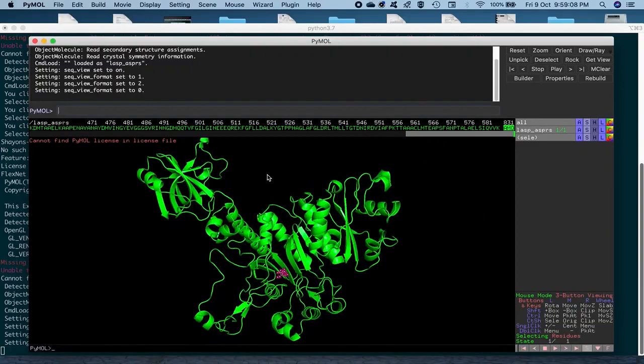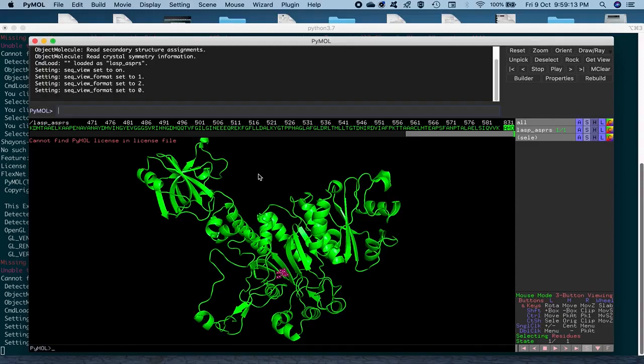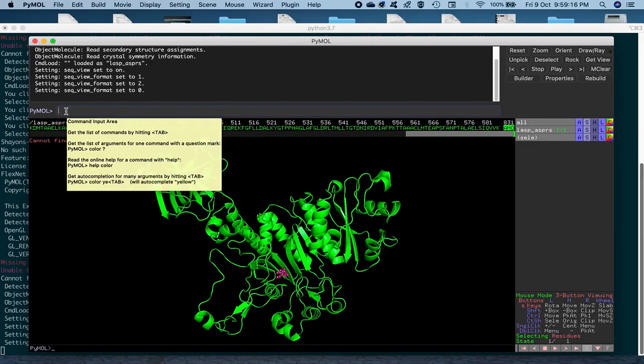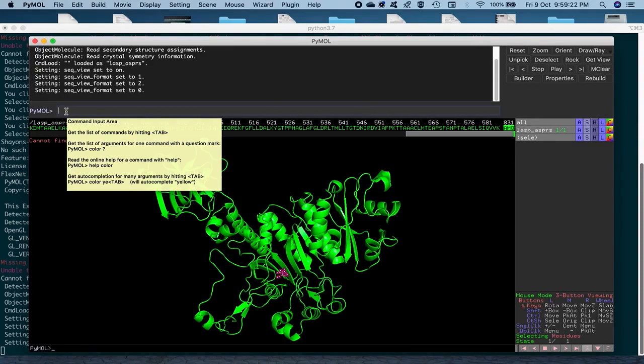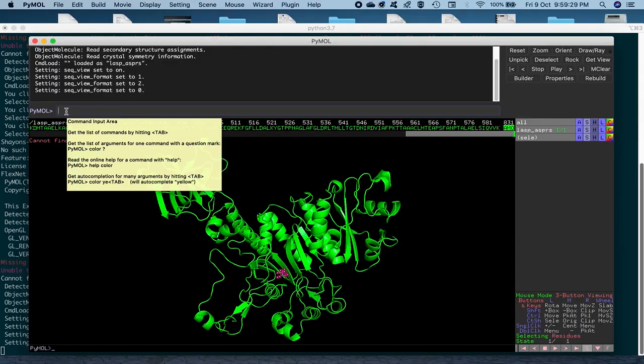PyMOL has a command line interface as well, just like VMD scripting language and Chimera's command line interface. And so, we're going to use this to change the name of the residue. So, you see it lists the command input area, get the list of command by hitting tab and everything. So, you can do a lot of things with this command line interface and using this PyMOL language that they have specifically. I've posted a couple of links on the slide which you can follow for this.